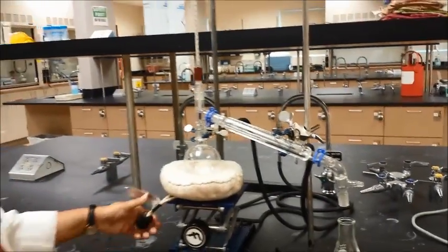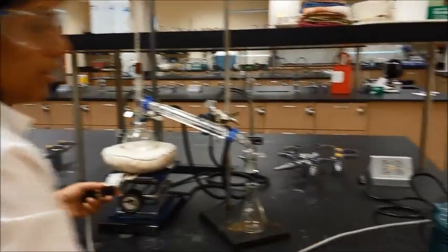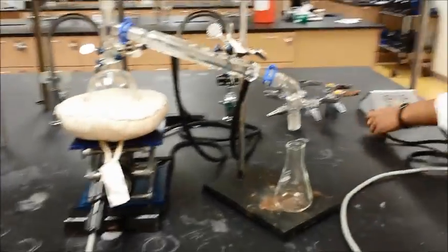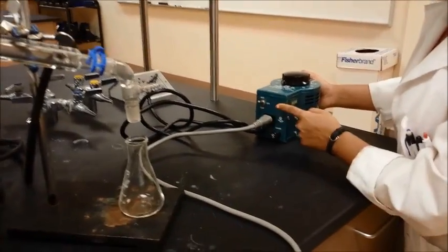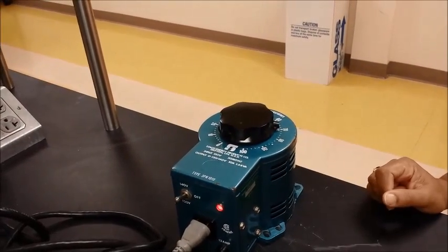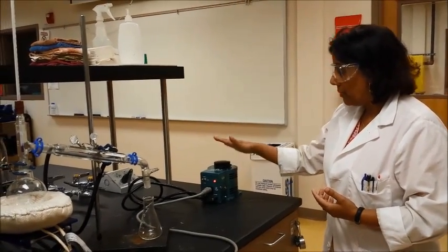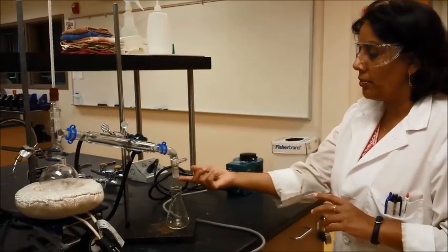Once you're all set, make sure all the connections are there. Take the heating mantle and connect it to the rheostat — the rheostat will control the heating rate of the heating mantle. Go ahead and plug in the rheostat; once connected, turn it on. Usually you turn it on a little bit high to get the heating started — start at 60 or 70 to get the boiling going, and then lower it down depending on what you're doing. For simple distillation you can have it higher; for fractional distillation you may need to lower it. Make sure the distillation is going at a small drip — one drip per second — which is how much you're collecting.